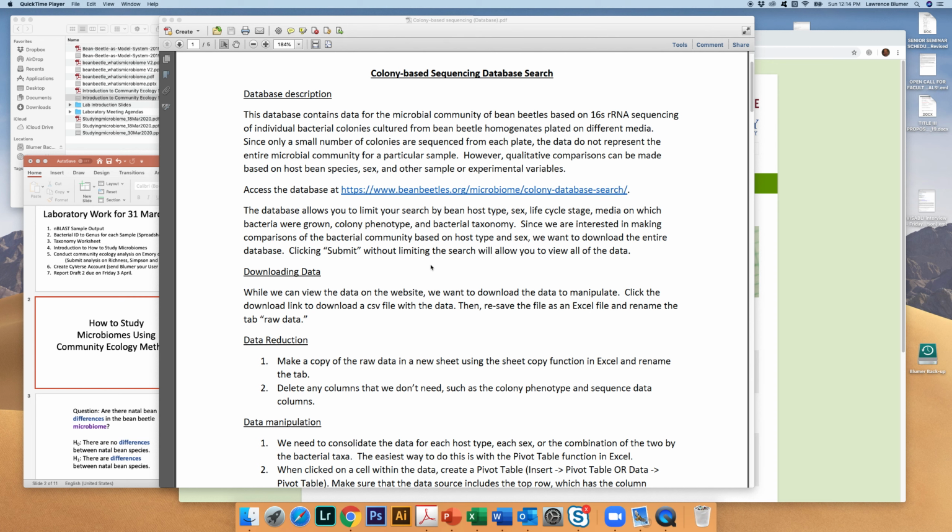The video that I've prepared here is about the colony-based sequencing database search. You should have this handout in front of you. This is a handout that your instructor should have made available to you, but it's also available on the Bean Beetle website.